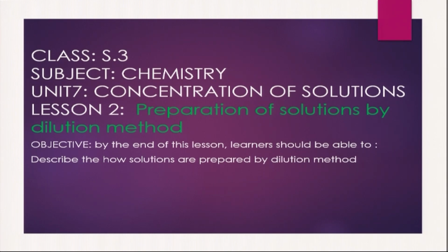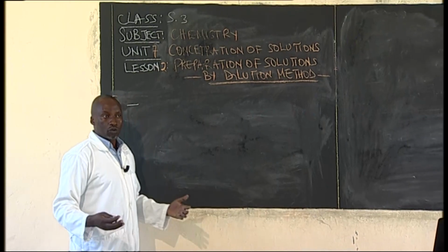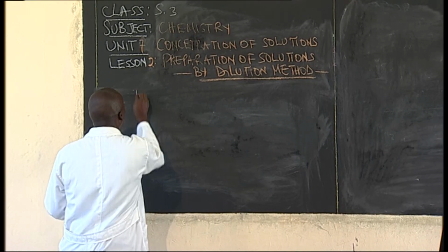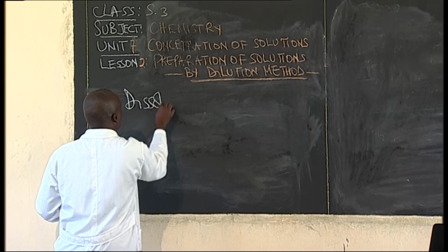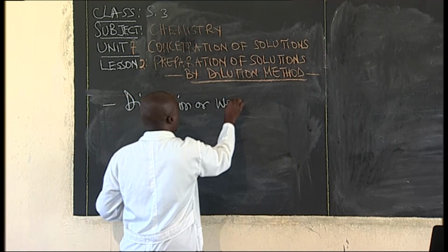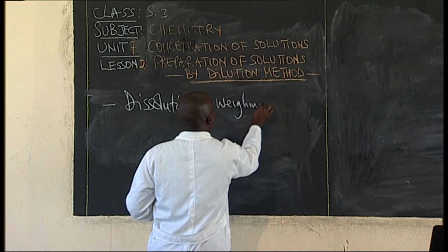You remember in the previous lesson, I told you that we have two methods that we use to prepare our solutions. The first method was by weighing. We said it is either weighing method or dissolution method. So we can call it dissolution or weighing method.